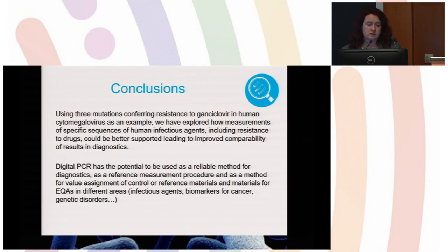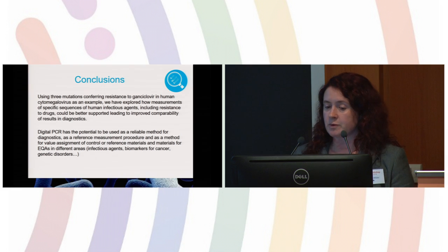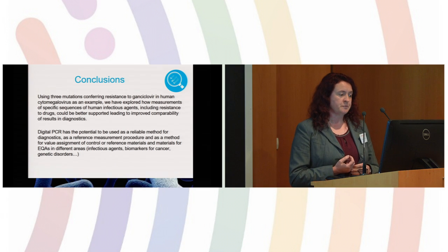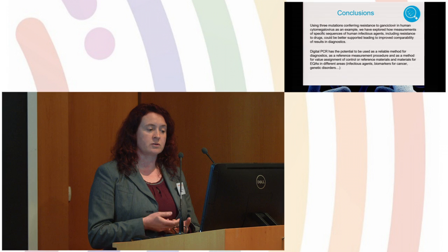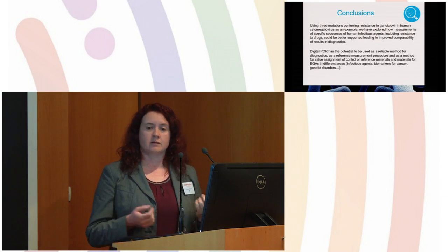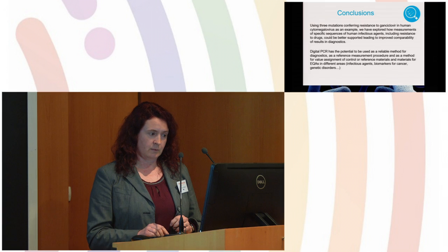Digital PCR is a method that has the potential to be used as a reliable method for diagnostics, but also as a reference measurement procedure and as a method for value assignment of control or reference materials and for materials used in quality assurance schemes. And this is for different areas, not just infectious agents. The same method can be used, for example, for biomarkers of cancer, for other genetic disorders, but also other areas like plant pathogens or environmental samples.